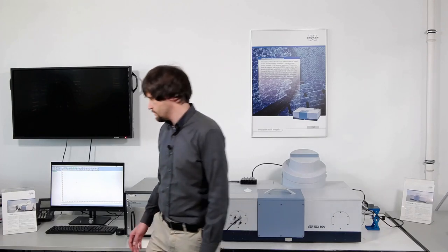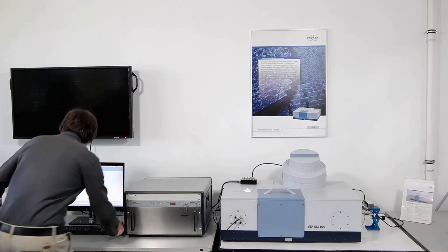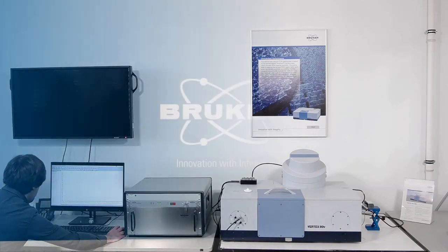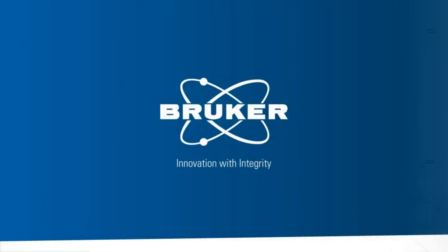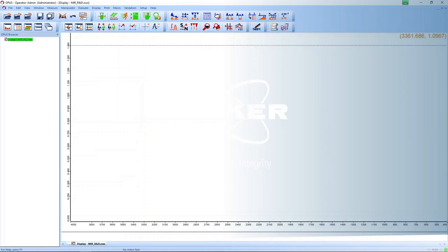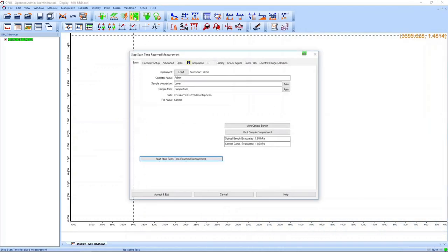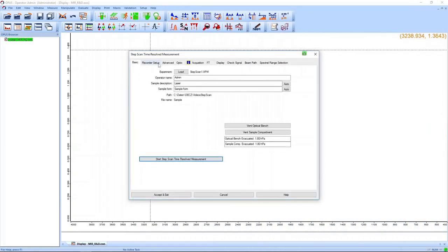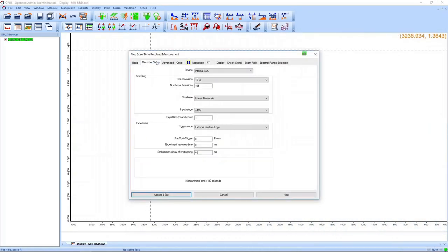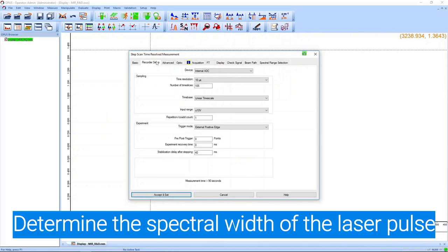After we set everything on the hardware, we can start the step scan measurement within the OPUS software. We open the step scan measurement dialog and choose experimental parameters which are the same as in a standard measurement.